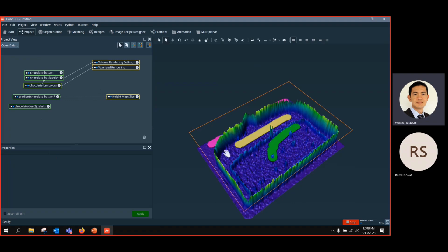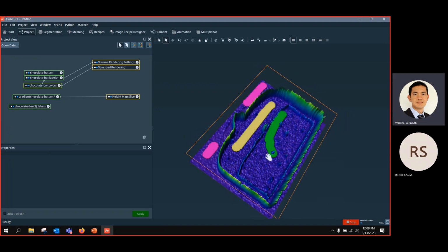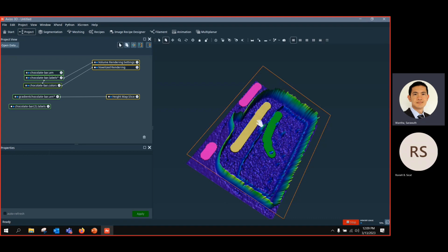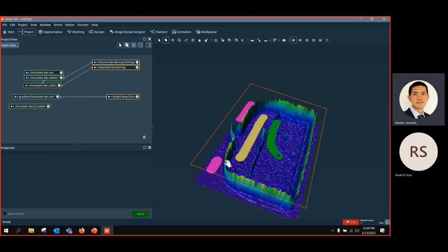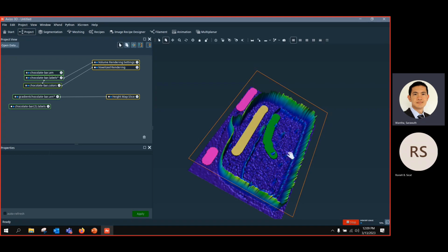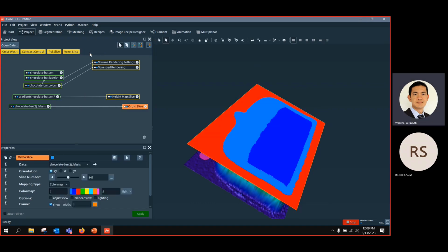So go back to this height map slice and all the markers. Remember, I transformed the chocolate bar into a gradient image, and then I manually painted only a few markers for each catchment basin. As you can see here, there are at least 3 basins, and each basin has corresponding markers that I added: pink, yellow, and green. And when you start to grow them, you should see the final result that looks like this.